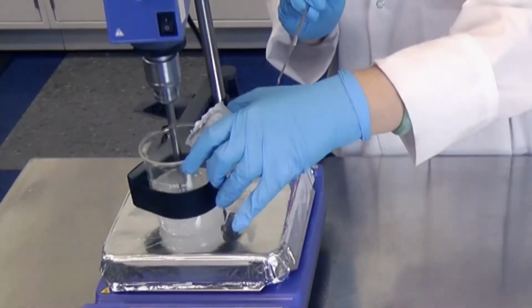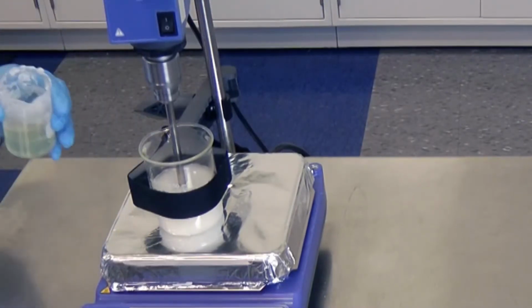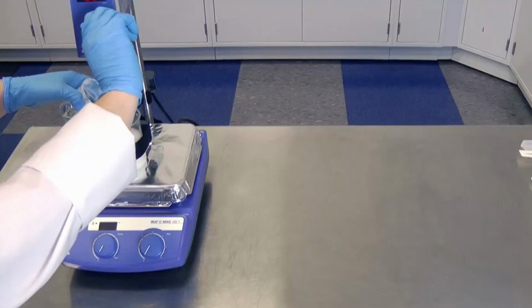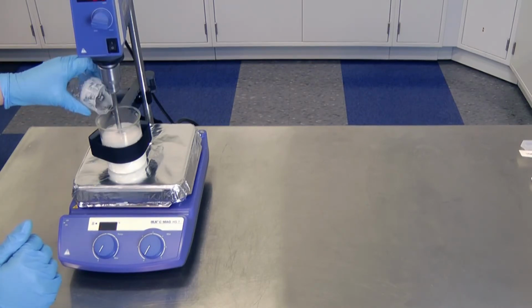Now that both our oil and water phase are at 70 degrees Celsius, we may begin adding the oil to the water phase. As you can see, a nice white emulsion is formed. As you add the oil, it will thicken the water phase considerably, so increasing the propeller might be necessary.